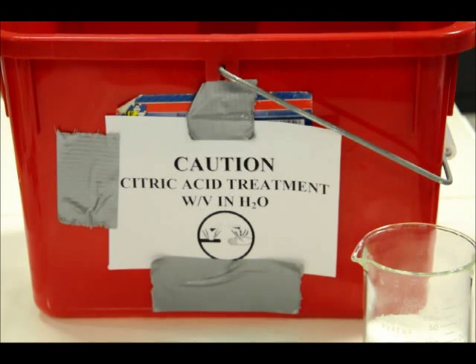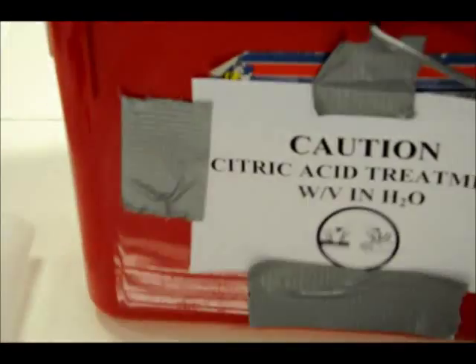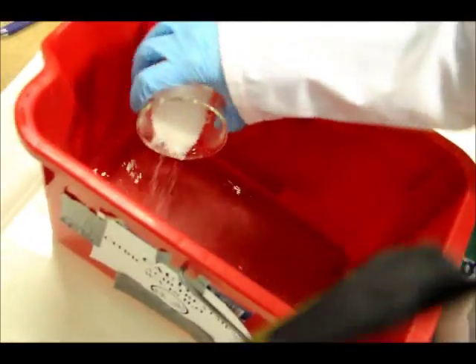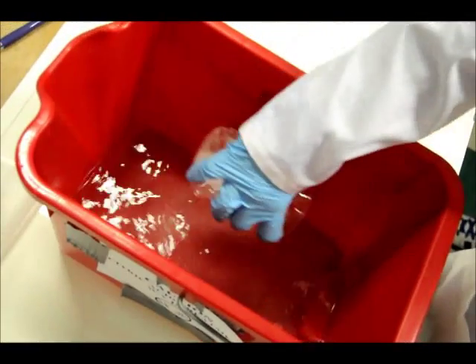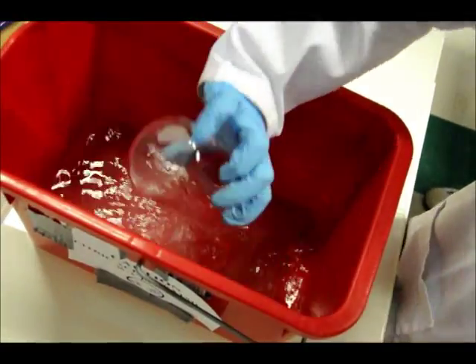Take the crystals of citric acid and dump them into the bath, spreading them around as you pour them in. The citric acid is being added to the water and will dissolve with some stirring. We use a glass stir rod to stir up the solution so it dissolves into the deionized water. Take the beaker, put it right into the water, give it a little scoop and rinse it out, then dump it back in. The crystals haven't dissolved yet, so continue stirring.